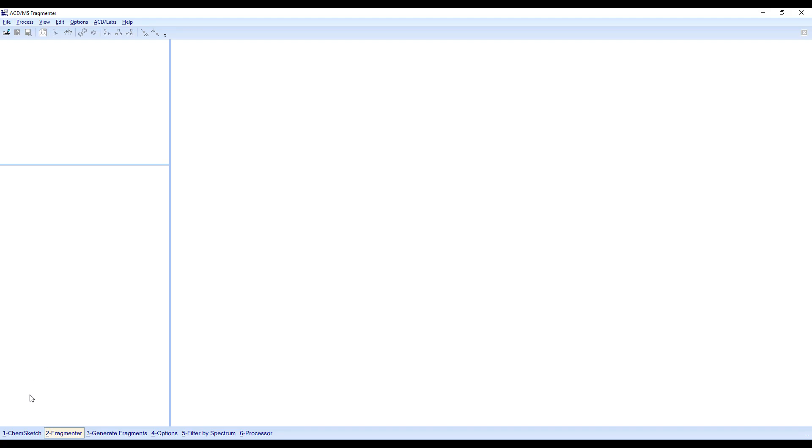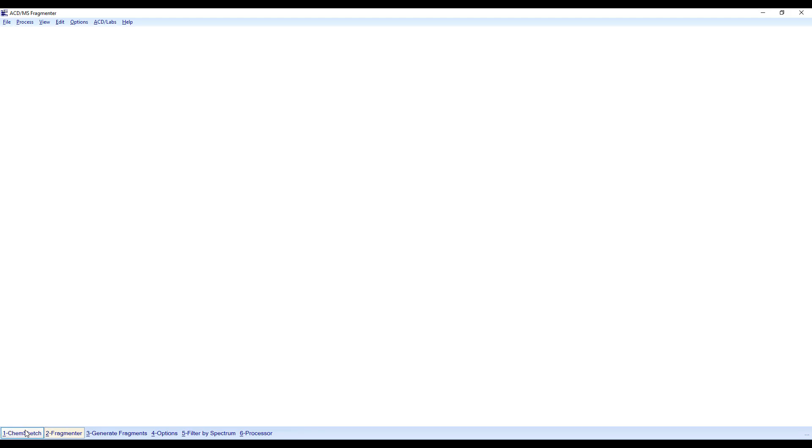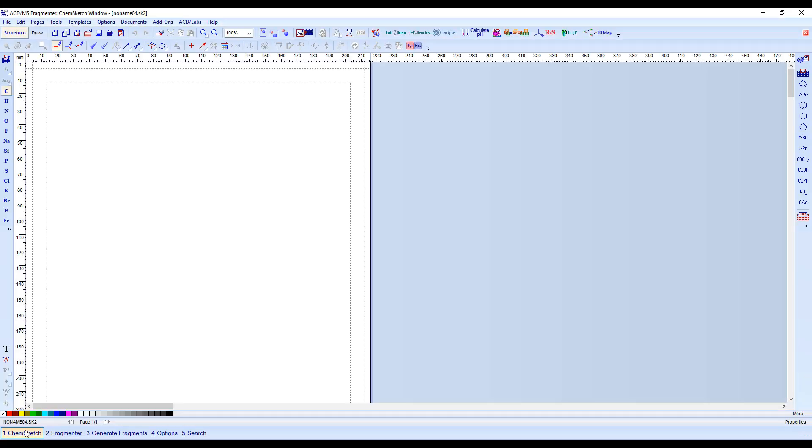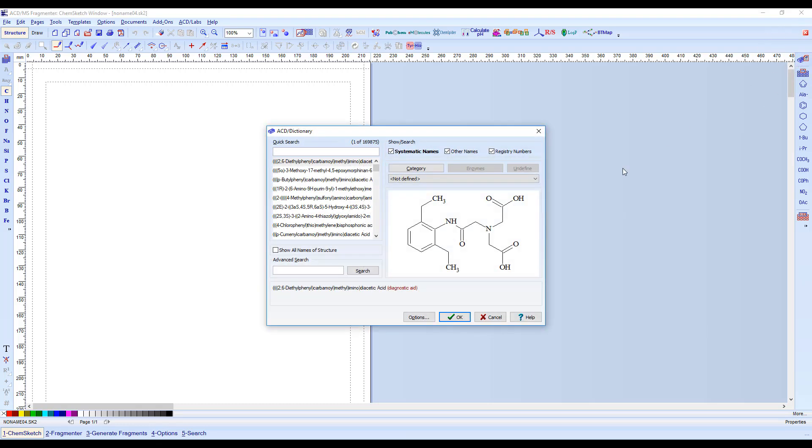Click on the ChemSketch button in the navigation toolbar. Draw or open a structure of interest. Here, I'm using the Dictionary tool to insert a structure.